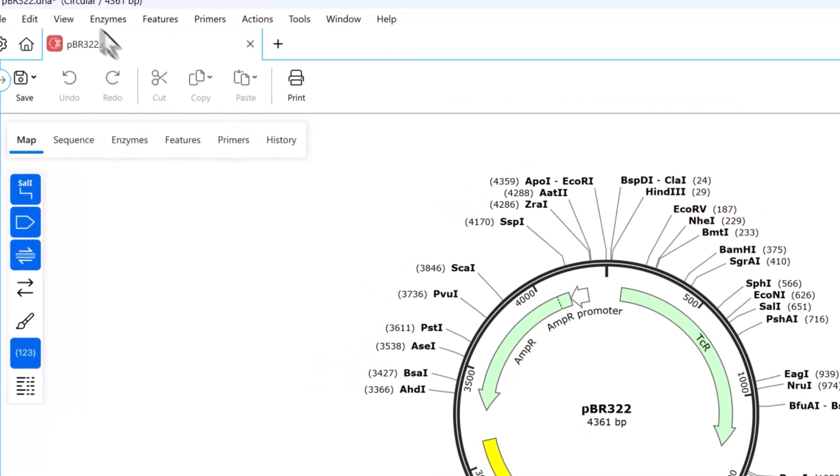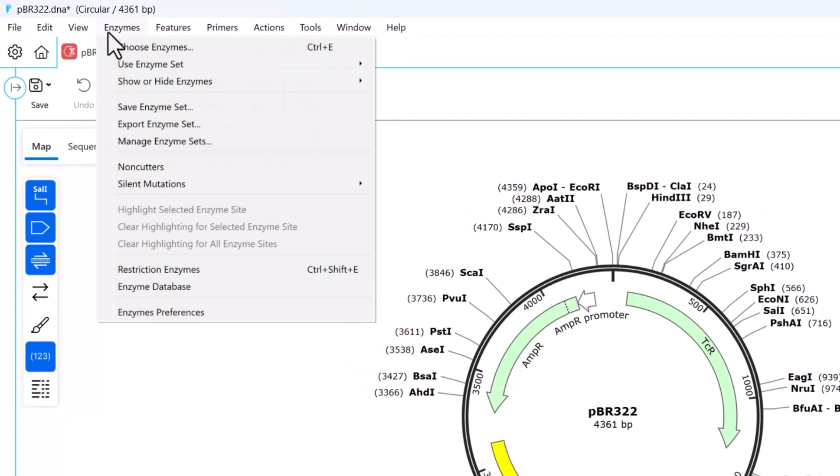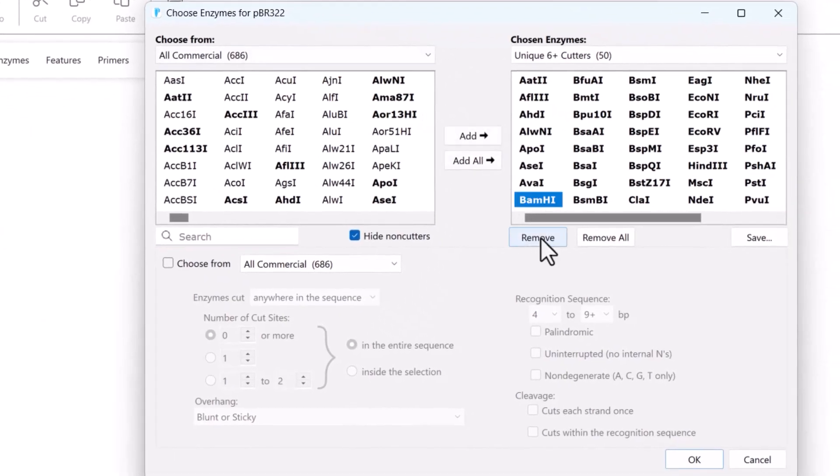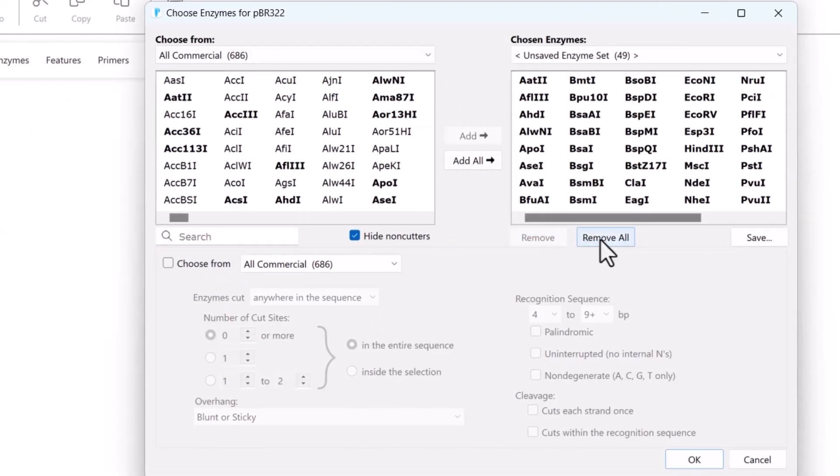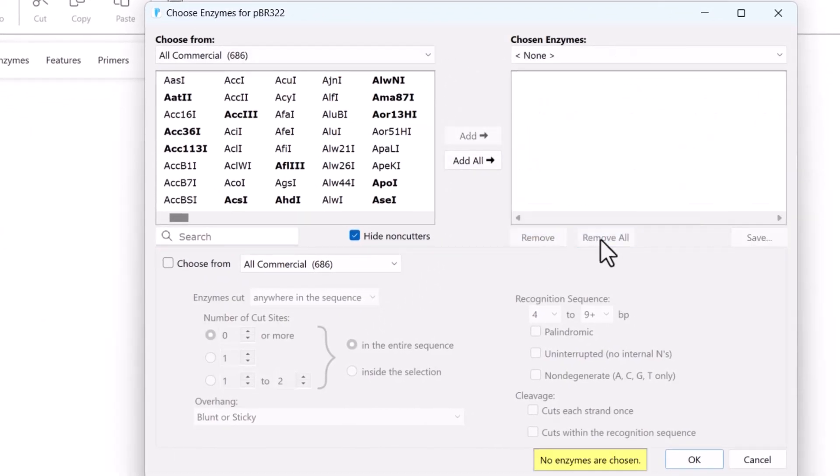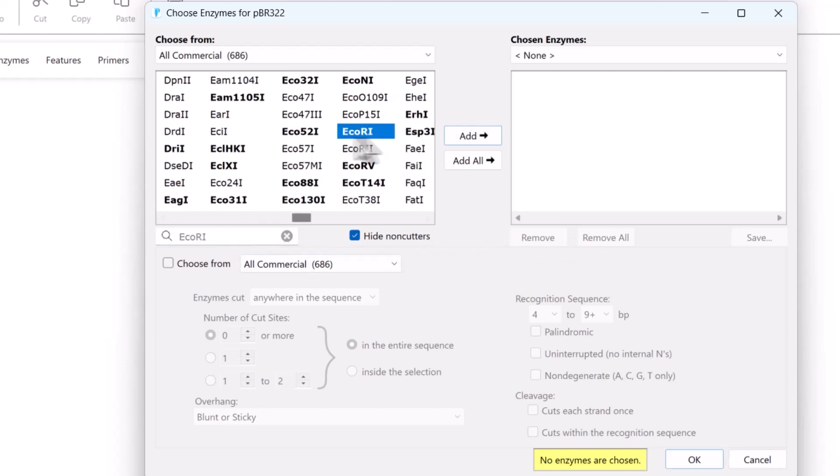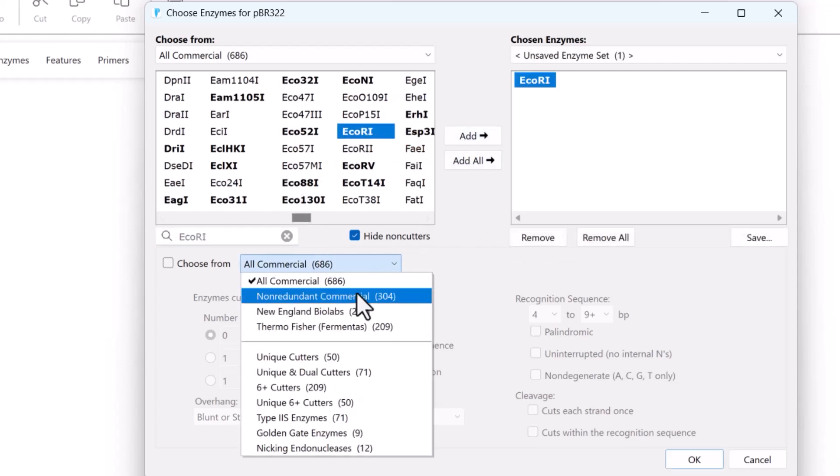SnapGene allows you to remove enzymes manually, either one at a time or all at once. To add individual enzyme sites, use the search field or filter by enzyme set.